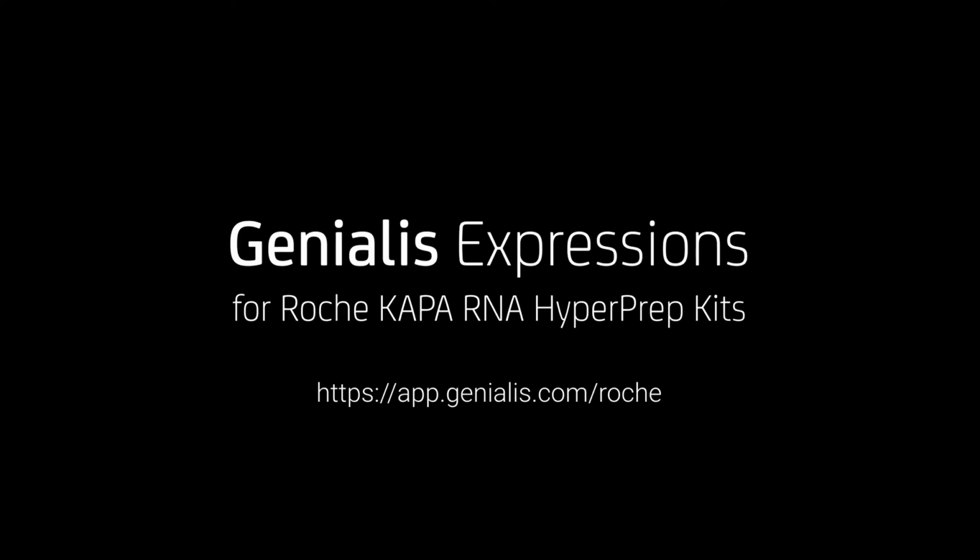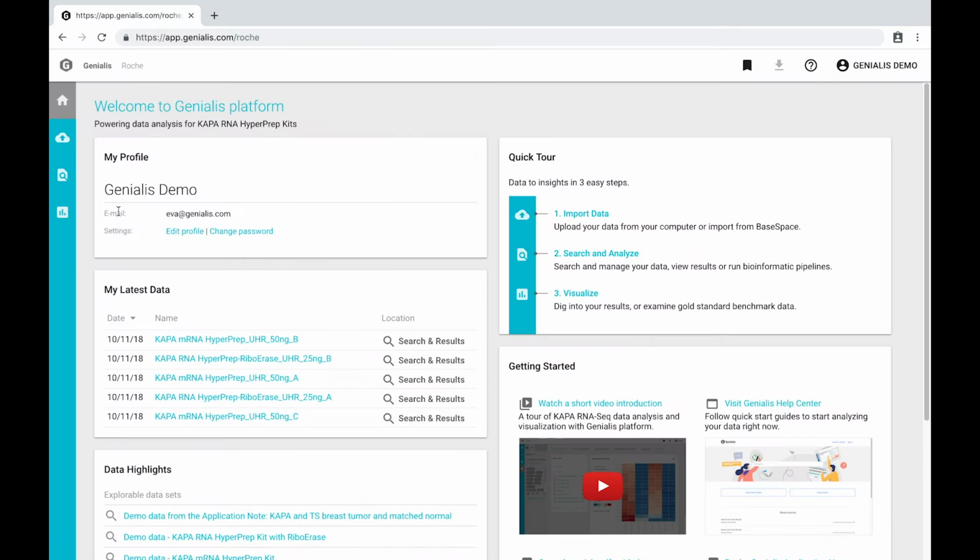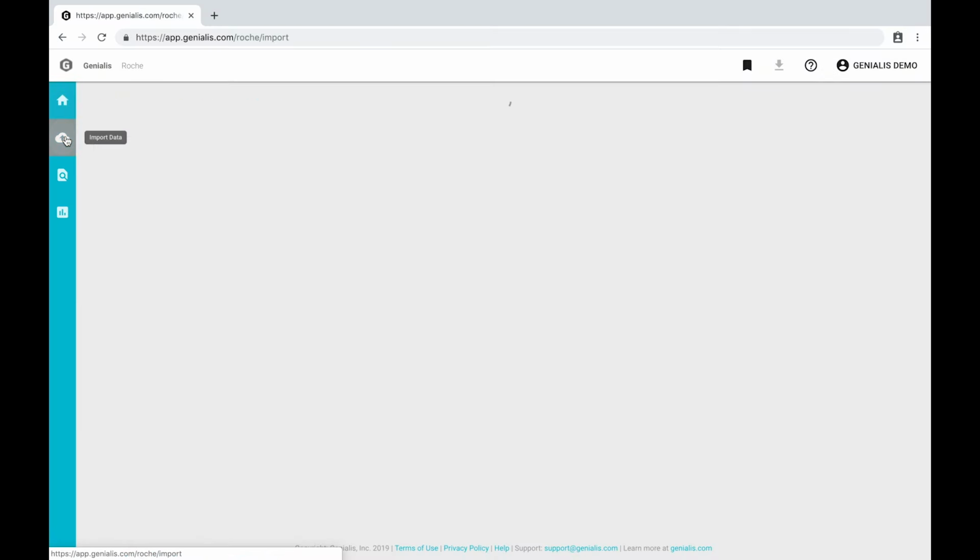Welcome to Genialis. In this video, we'll walk you through our application designed to analyze and visualize data obtained with Roche KAPA RNA HyperPrep kits. We'll show you how you can manage and interpret your RNA sequencing data without having to rely on bioinformatics scripts or collaborators. First, you'll need to upload your data to the platform.